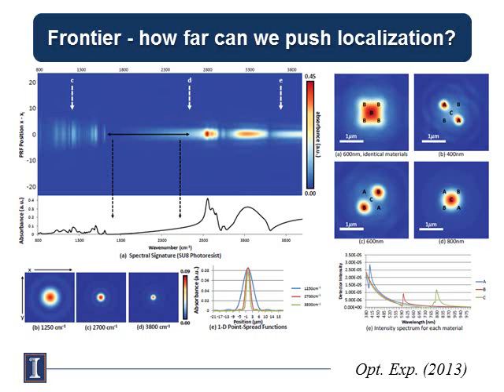I think the best analog for this sort of approach is single molecule fluorescence, what is sparsely illuminated and recorded in super resolution mapping, the PALM/STORM type of approaches. You can do that not just in the time domain; here we are showing you can also do that in the spectral domain. Of course, you could do this in Raman imaging, which is also something we're trying. All you would need are nanoparticles, for example, and then you can localize within a given focal volume where each particle is, provided there are some spectral differences in those particles.